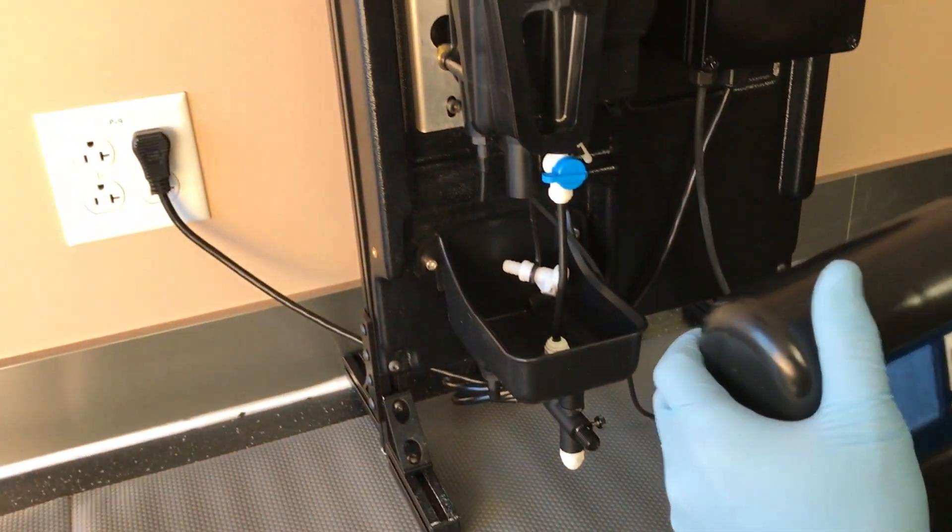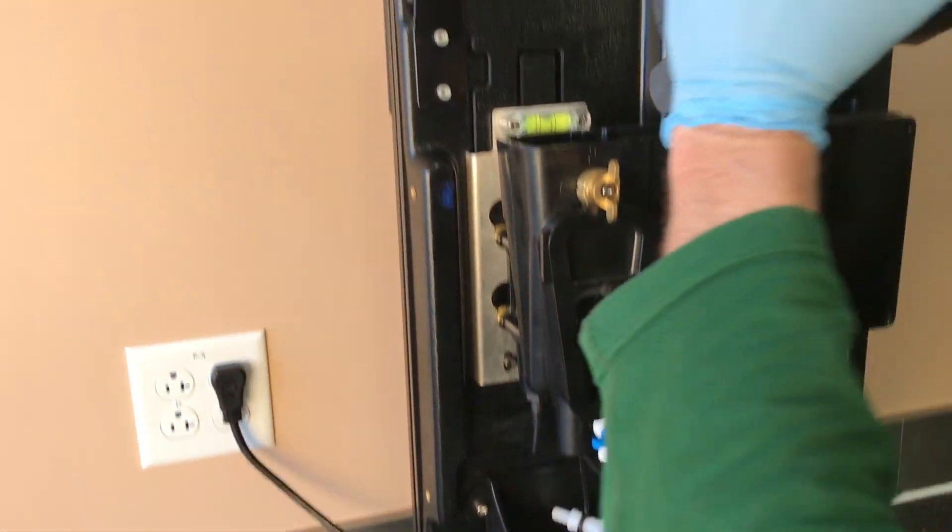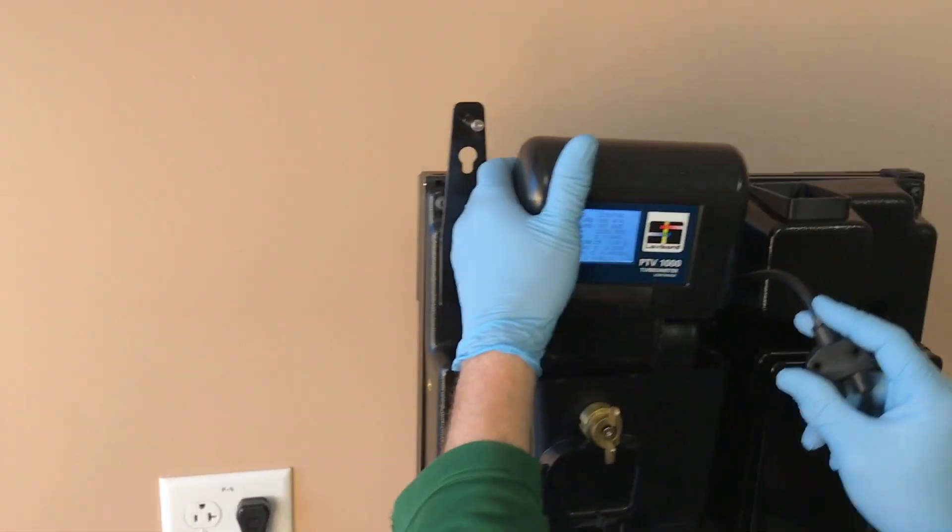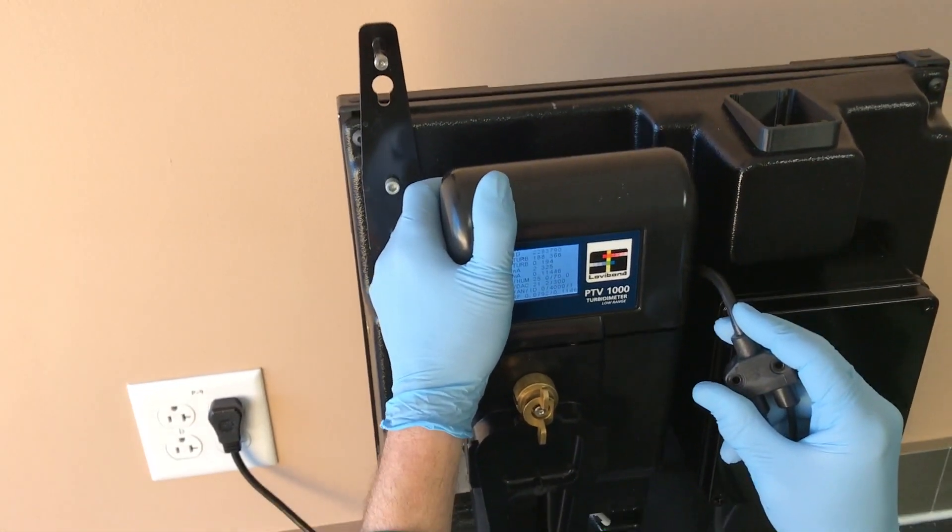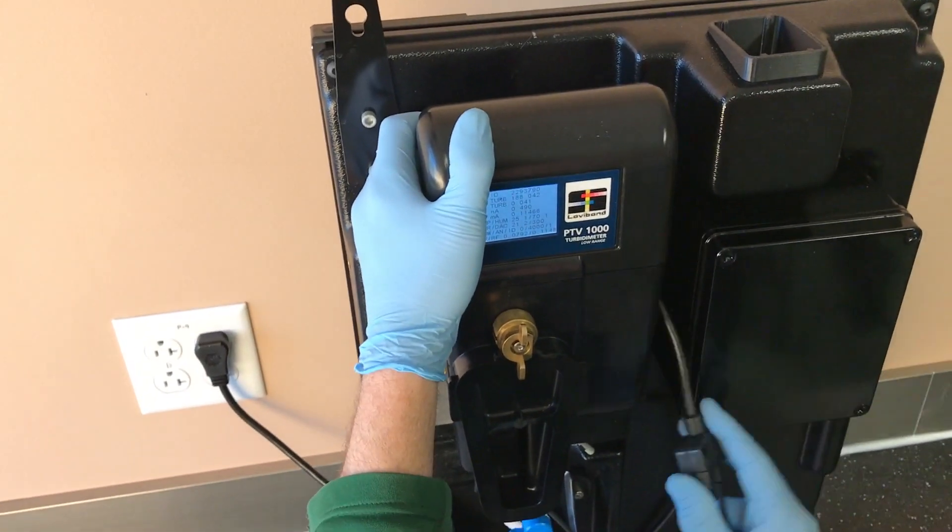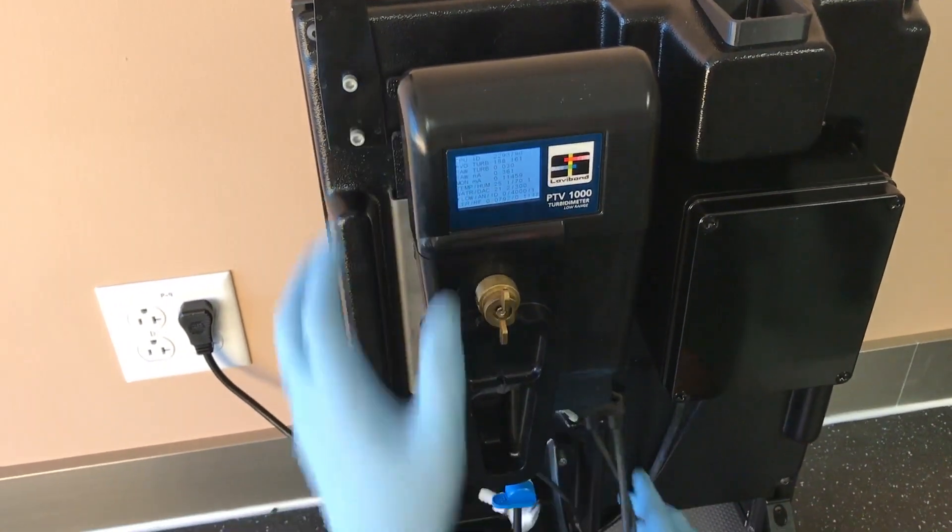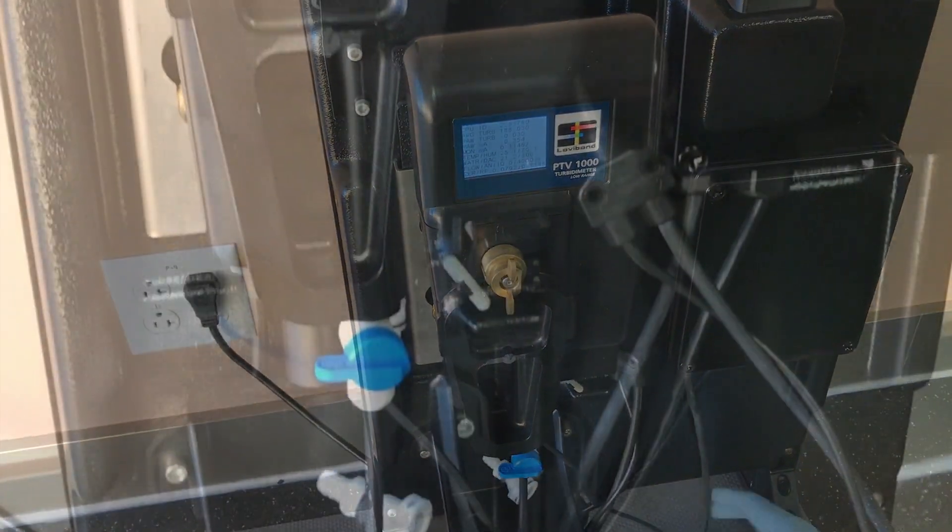Put the measurement module back into the flow body. It is recommended that users perform a sensor verification to ensure proper readings.